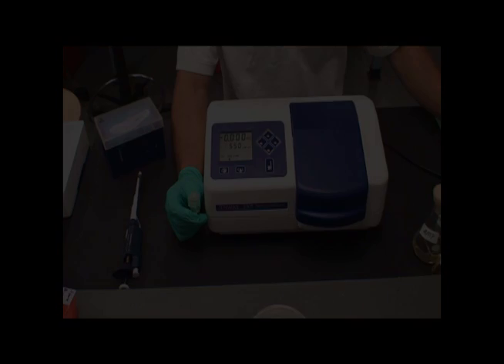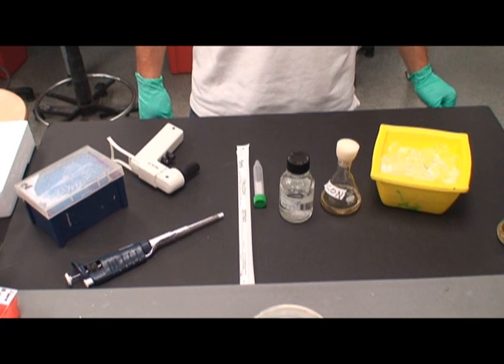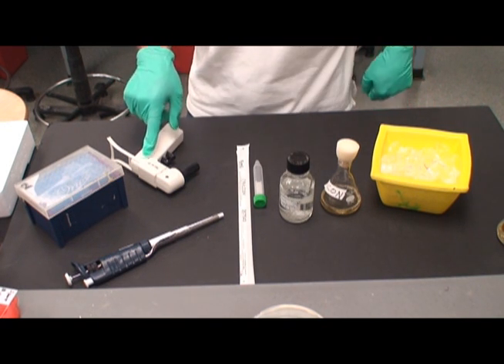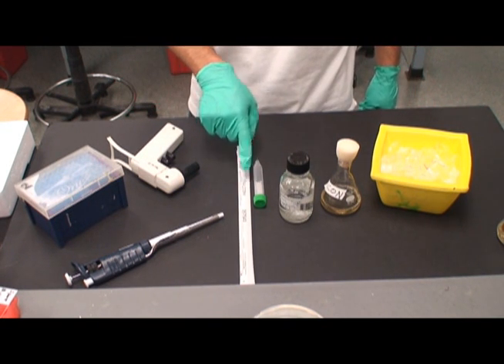We will now combine 0.5 milliliters from the control flask with 4.5 milliliters of phosphate buffered saline, a tenfold dilution, using the power pipetter.